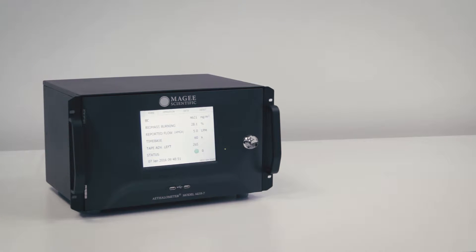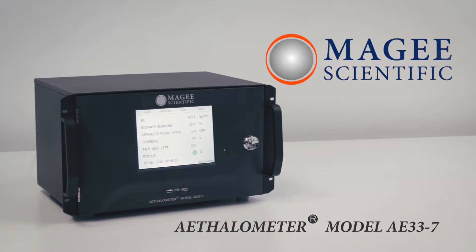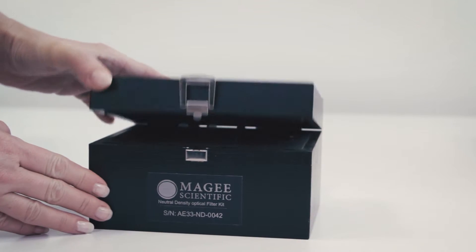This video shows the operations of the Neutral Density Optical Validation Test Kit for the model AE33 aethalometer. For this test, you will need the ND Kit box, which consists of four different optical filters.